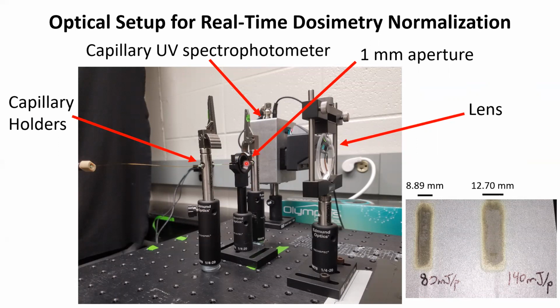The aperture also helps take care of what's known as laser jitter, or axial diffusion of the laser. The laser can actually change its trajectory coming out of the beam. It's not by much, only by a degree or a fraction of a degree. But since we have to measure this illuminated cross-section very carefully, a deviation of a degree can make quite a difference.